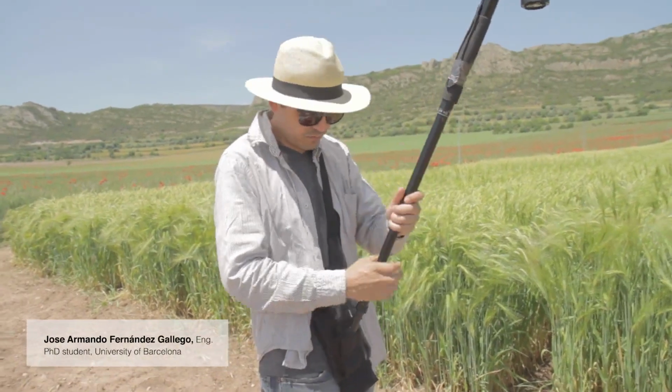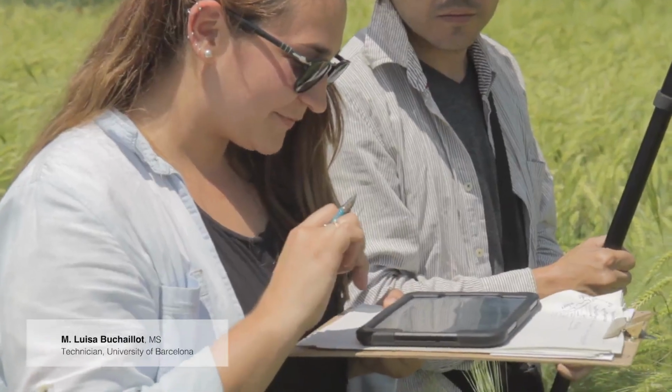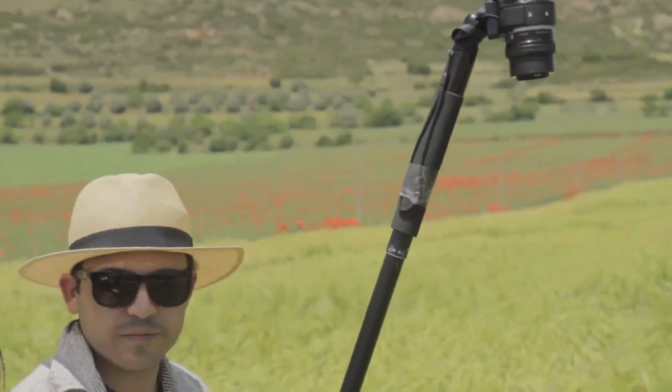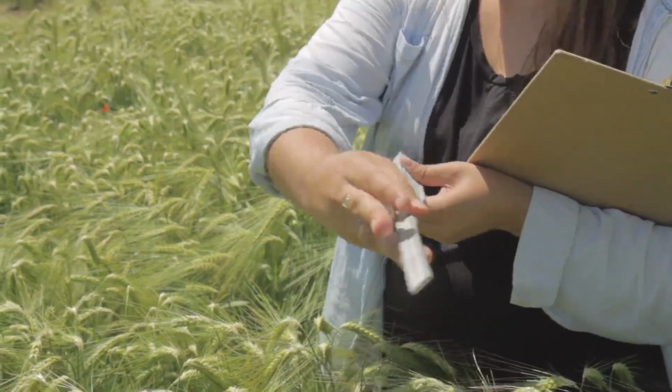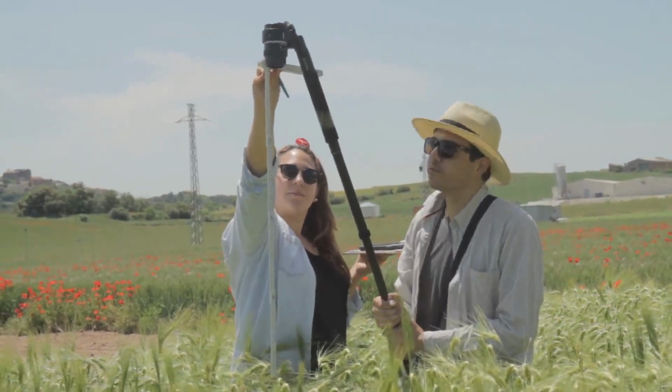The protocol that we have developed uses a 20 megapixel camera, taking pictures downward looking, perfectly zenithal or nadir, at a distance of approximately 80 centimeters from the top of the crop canopy.